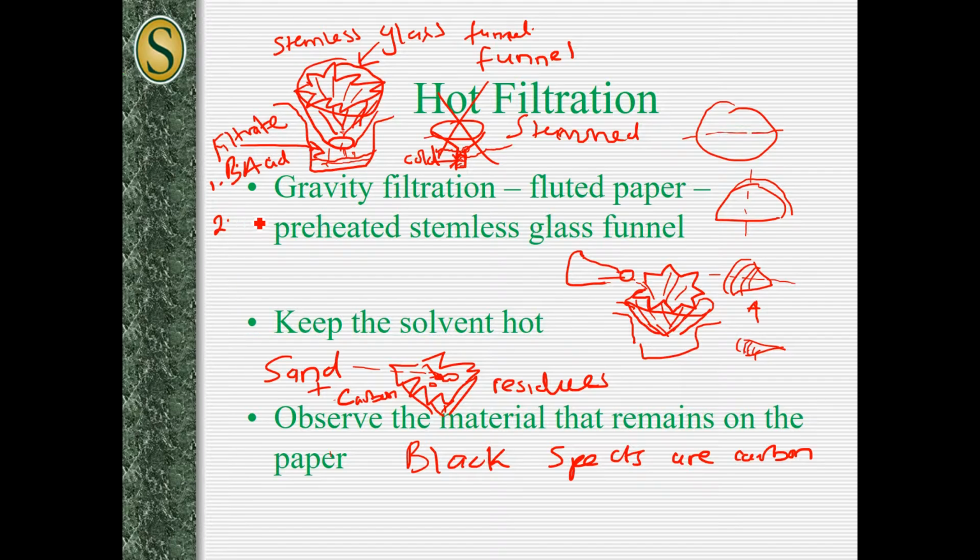Number two, you're going to have soluble impurities. And then number three, in there you have H2O itself.